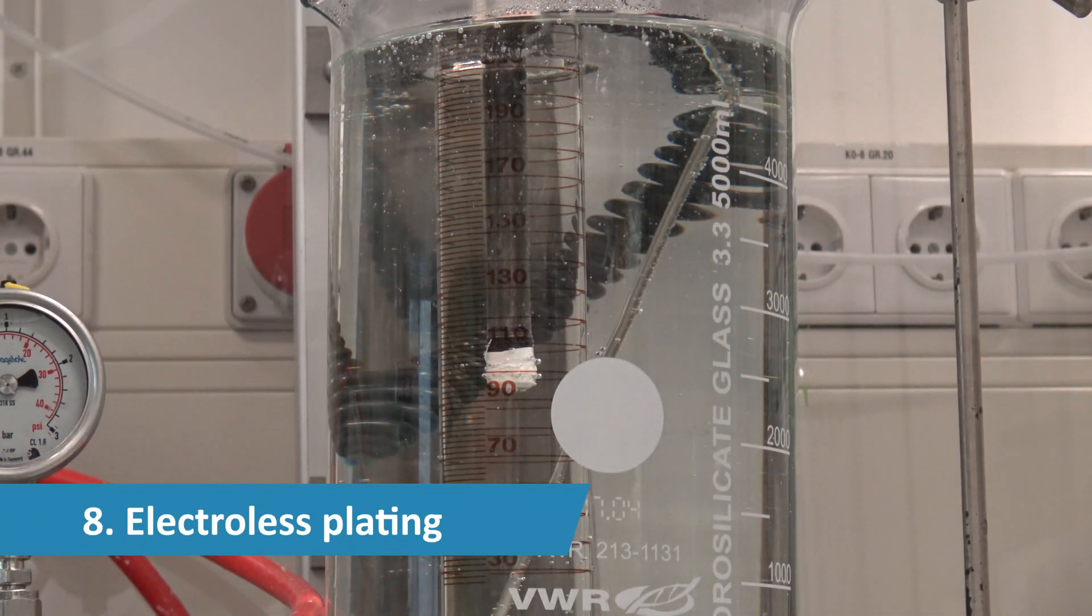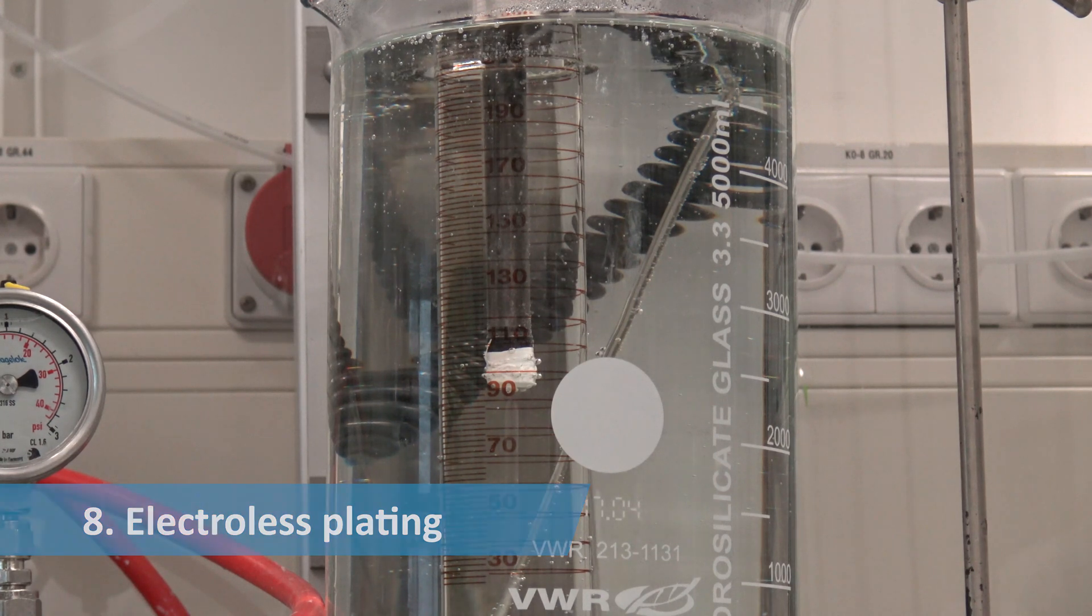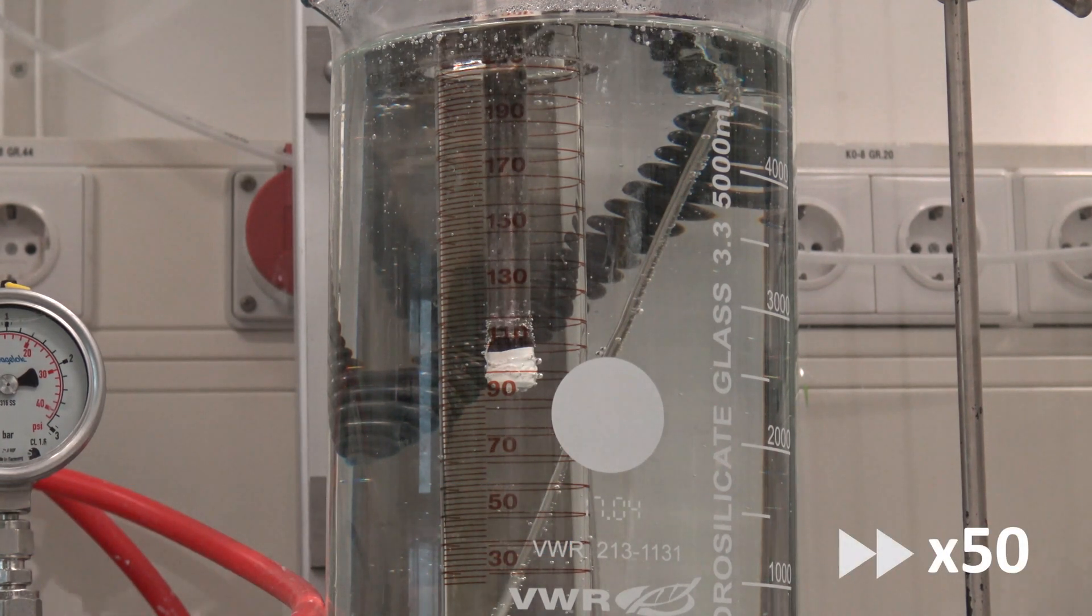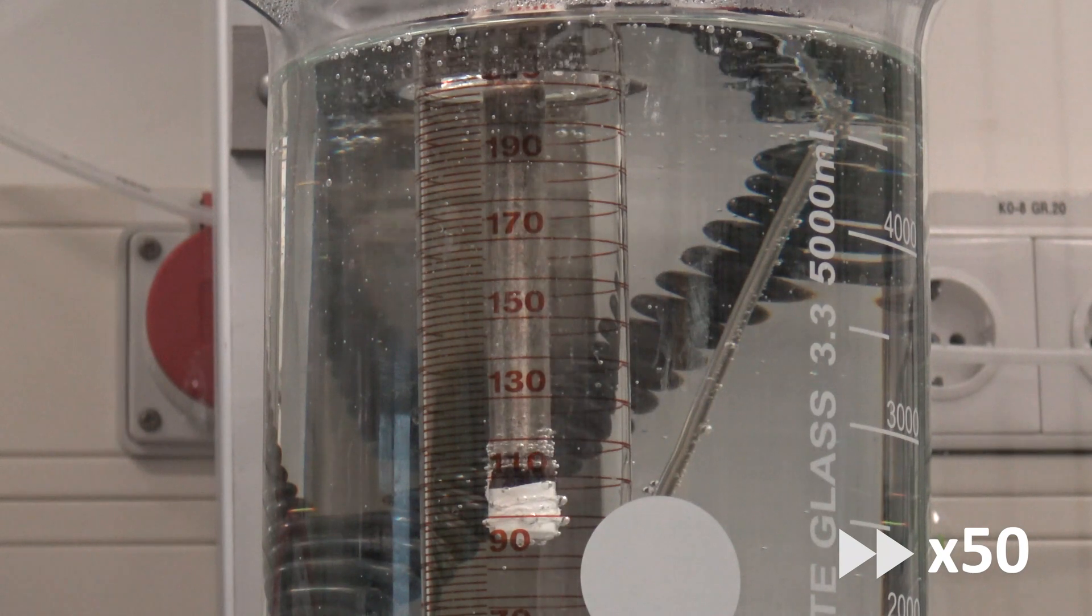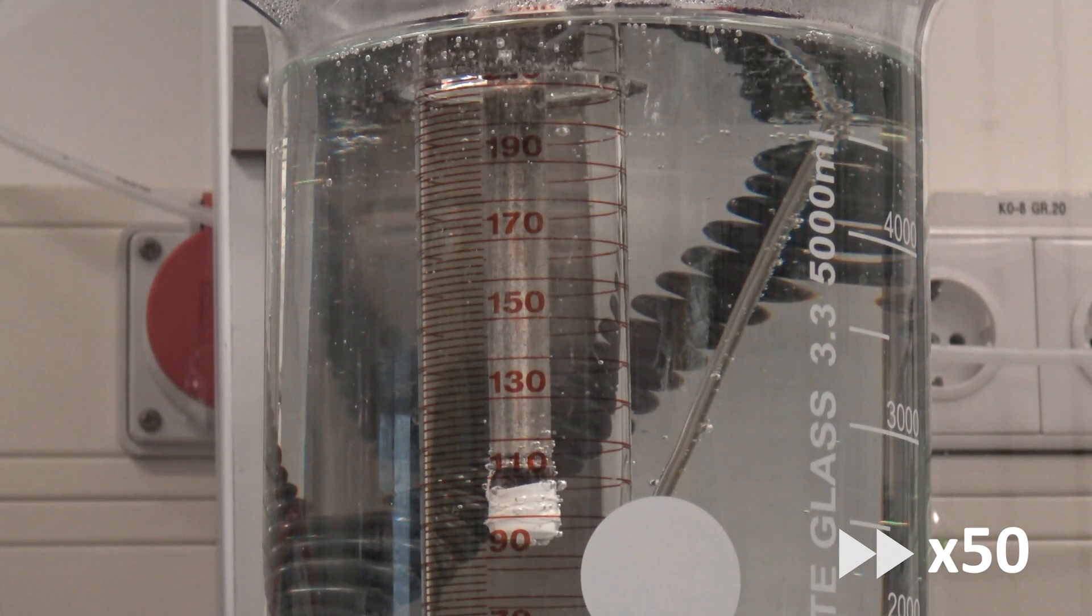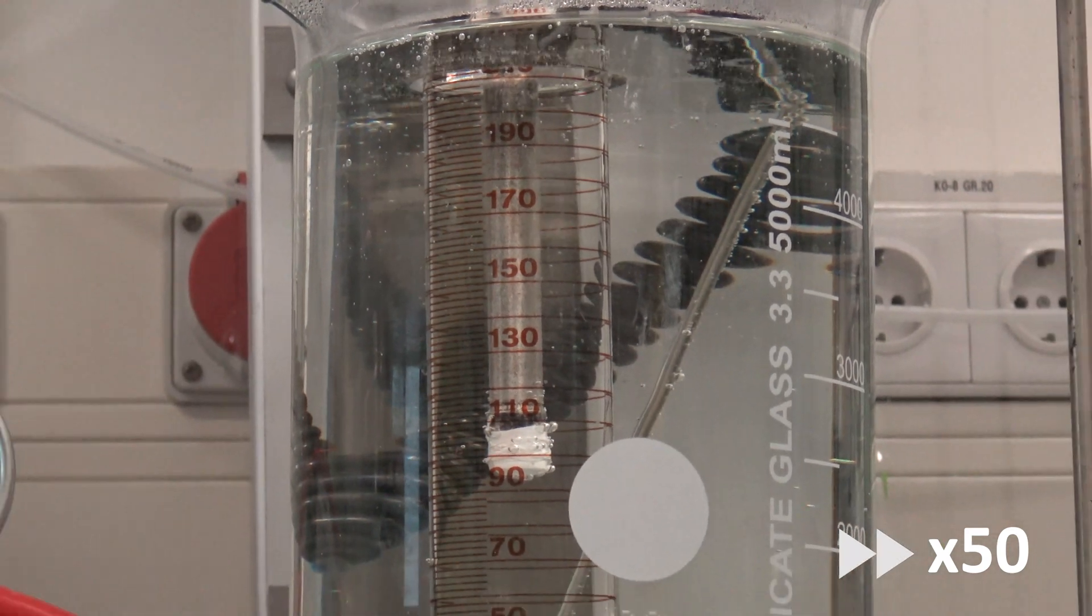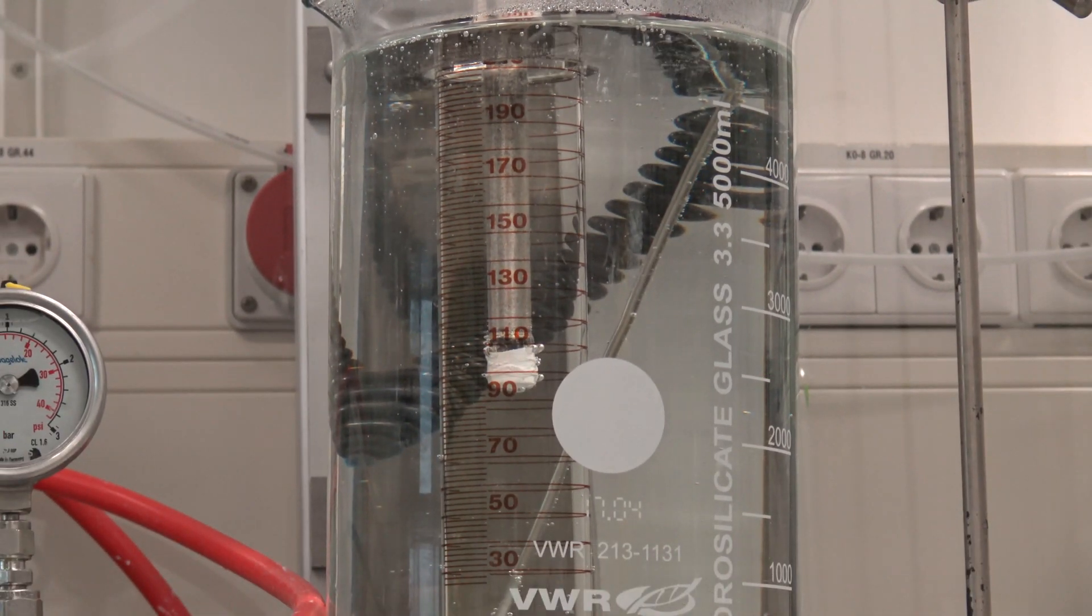Now the palladium silver layer is formed using an electroless plating technique. The support is placed in a solution of palladium acetate, silver nitrate, and various other compounds. Hydrazine is added to the plating bath to reduce the palladium and silver onto the metallic layer.